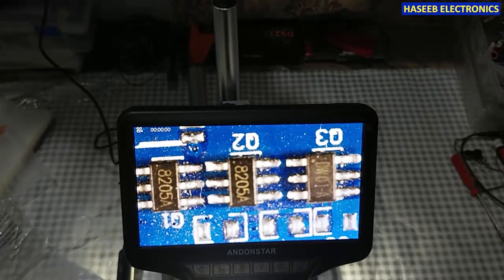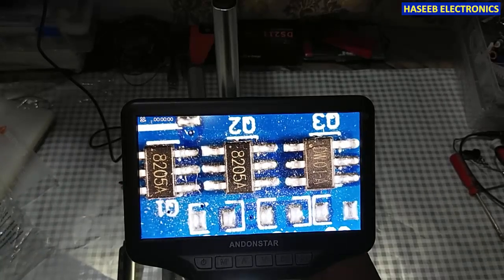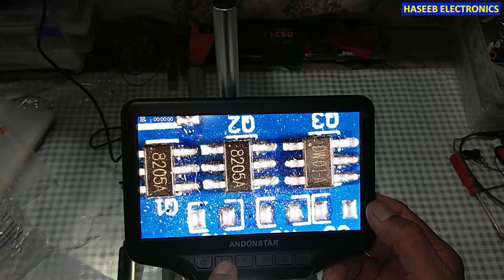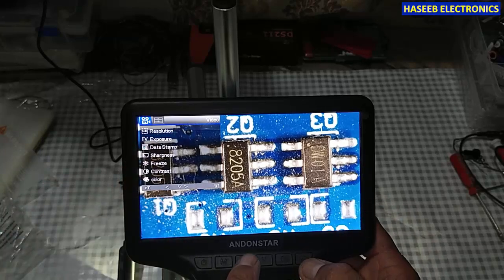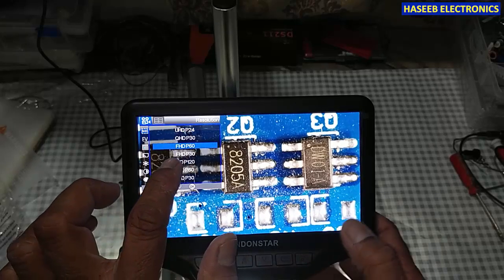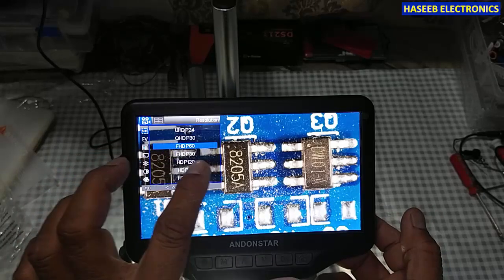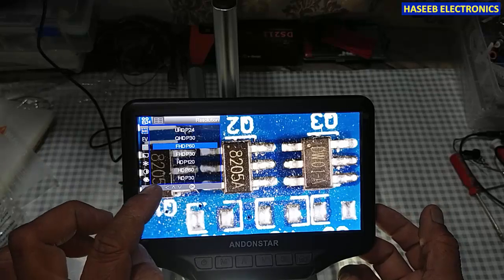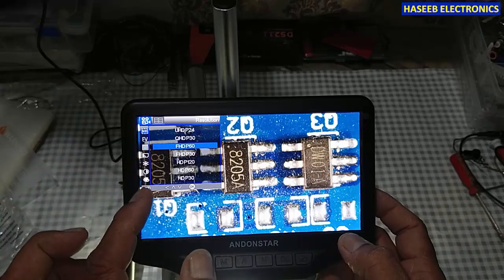Yes, it's now a very clear image. Here we have the menu button — if I press it for a long time it will display the menu with resolution options: UHD, QHD, FHD (full high definition) at 60 or 30 frames per second, and HD at 120 or 60 frame rates. We can set the resolution here and then it will record the video accordingly.